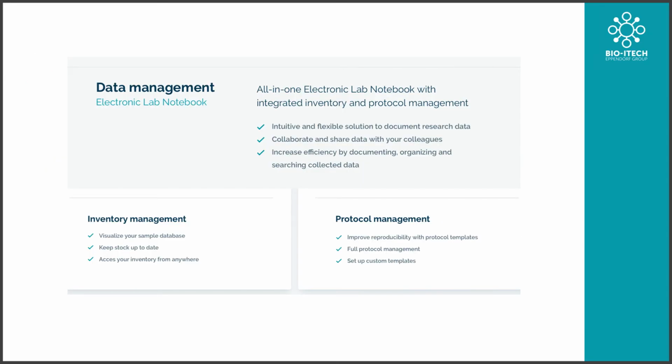As you can see, the disadvantages of LIMS systems is that they cannot store all of the relevant data that comes along with test results and actually capture the essence of context. This is better accomplished by an ELN system instead. ELNs are also super customizable to the way that each person works, whereas LIMS are more difficult to adapt workflows to and are generally IT managed.